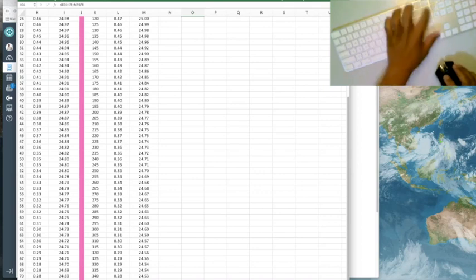You can do this on the Mac by pressing Option and then dragging it over. You can just drag it over. And you see how there's a triangle at the bottom? The triangle tells you it's making a copy. So it gives the original file name and then puts a 2 right next to it. Never mess with the original data. Always make a copy, so that if you make a mistake and you need to go back, the original data hasn't been altered.